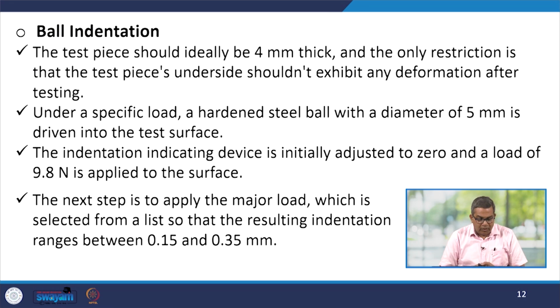Let's talk about the ball indentation. The test piece should ideally be 4 mm thick, and the only restriction is that the test piece underside shouldn't exhibit any deformation after testing.